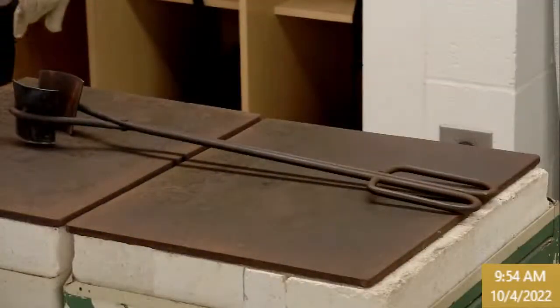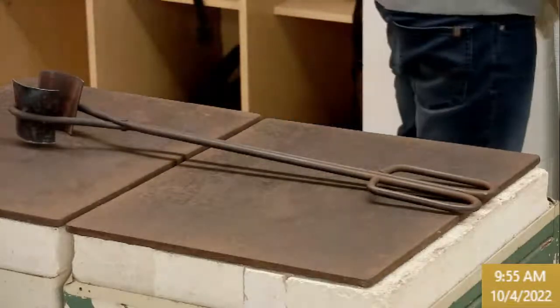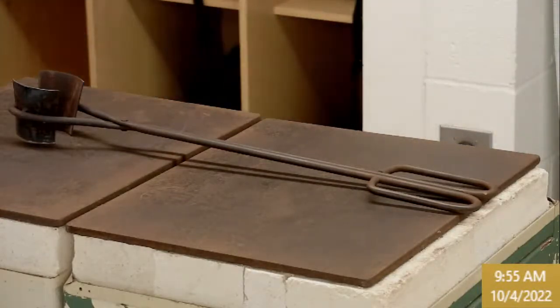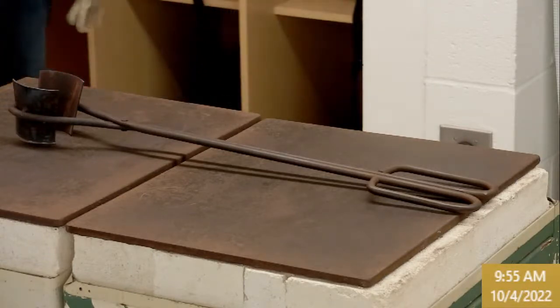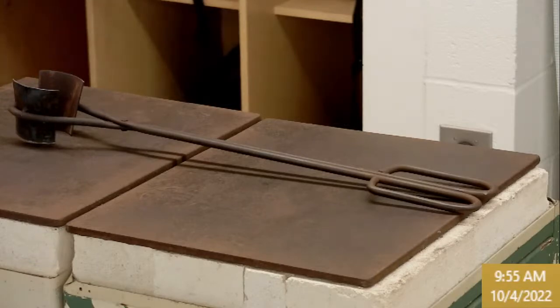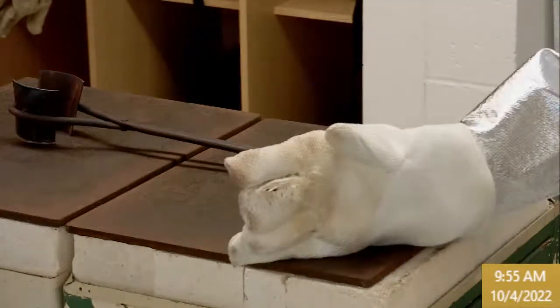What gloves did you say to use for stamping? I would probably just grab a pair of the nitrile gloves, yeah. All right, and the torch work sometimes gets a little toasty as well, so there are some welding gloves. Those thermal gloves are a little hard to control. All right, now I feel safe. So, yeah, it's pretty much the same as casting. Now I think we're in pretty good shape at this point.